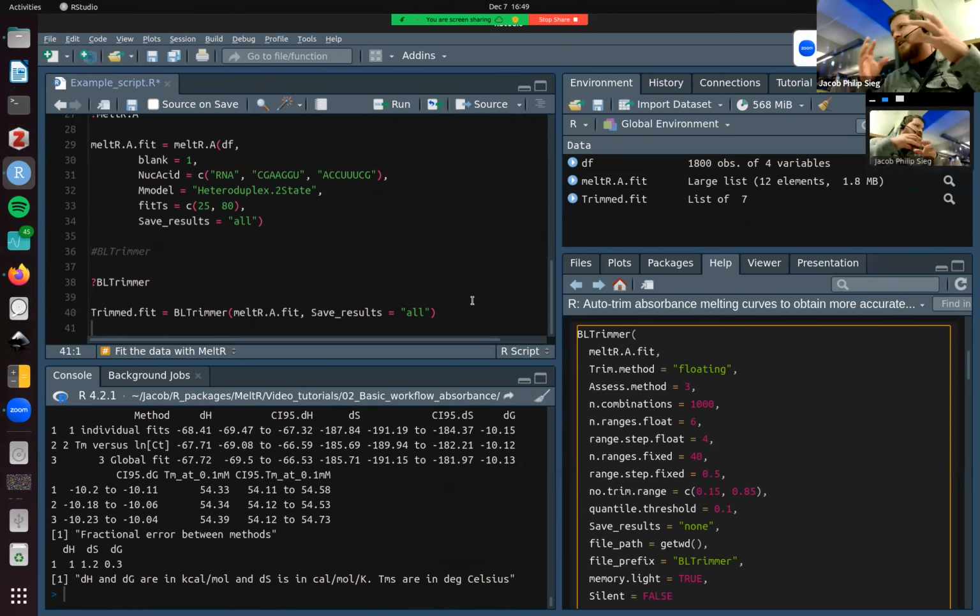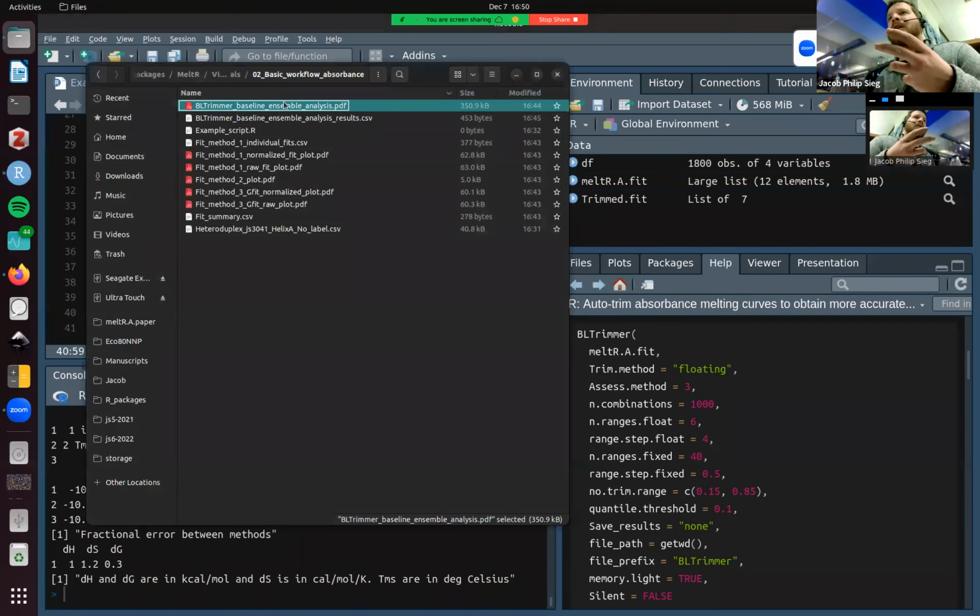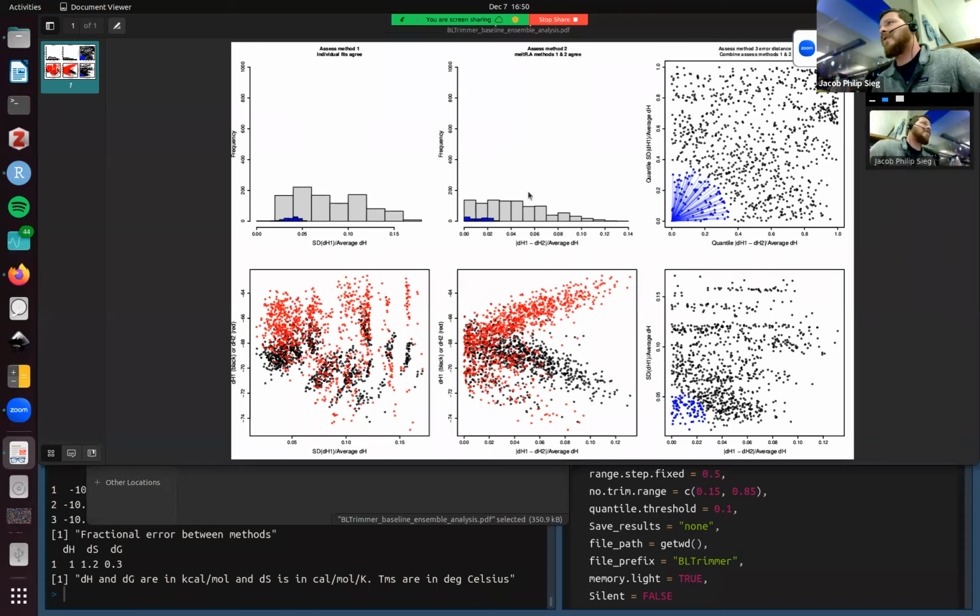If you're going to start changing parameters, you need to start worrying about two-statedness. And if we look here, for an approximate two-state folding helix, this distribution is going to peak below 10%.